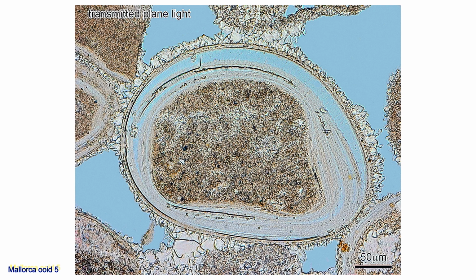The intergranular cement has a different fabric to that shown in previous thin sections. It nucleated on ooid surfaces at points about a micron apart and grew to form a druzy fabric before terminating after only about 10 microns growth into the 100 micron sized intergranular pores.